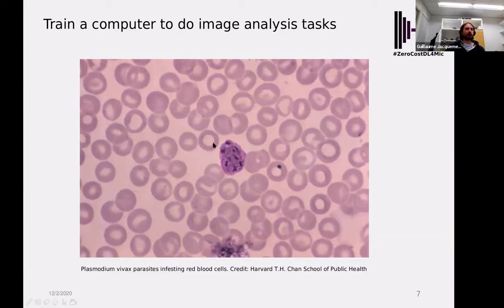You will also be able to identify that you have something else in the middle that has a different shape and different colors. But if you do traditional image analysis just based on intensity, then it's actually quite difficult to write a computer algorithm to distinguish between those objects, because there's not a lot of difference in terms of colors, and many of those objects are overlapping. However, now there are computer algorithms that you can train to behave a little bit in the same way as your brain does, in order to identify those patterns. And that's really the aim behind computer vision: to make use of these tools to analyze images.